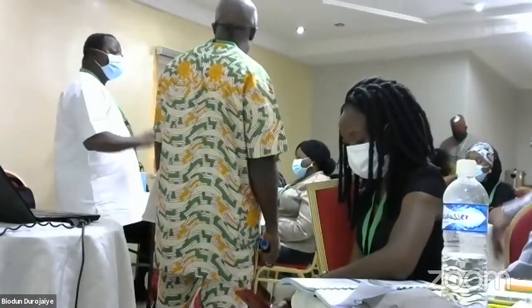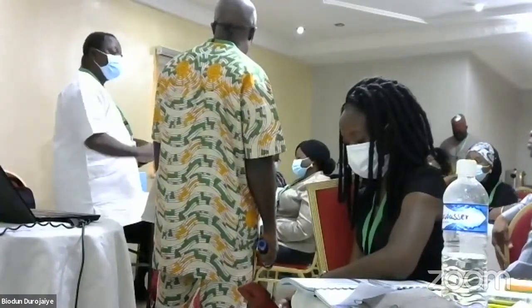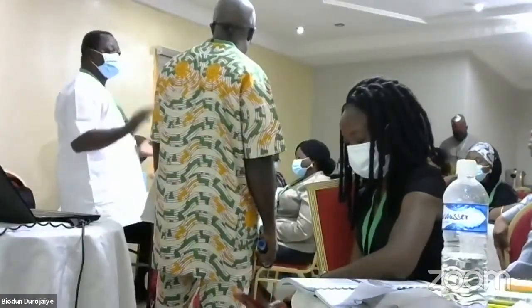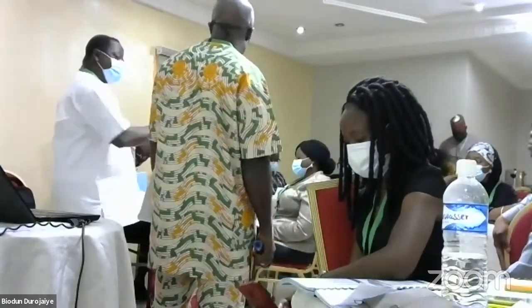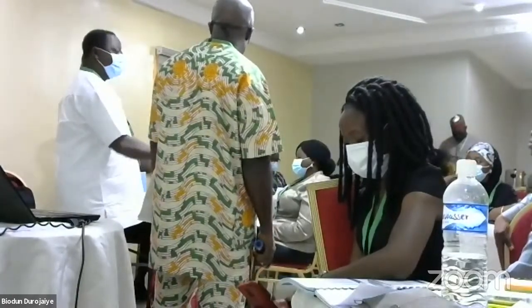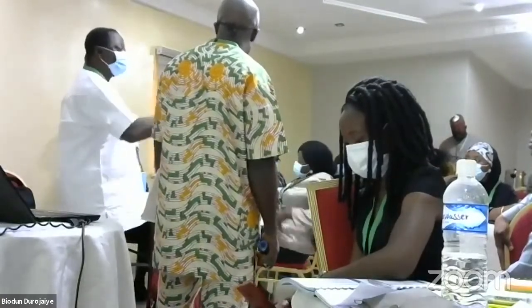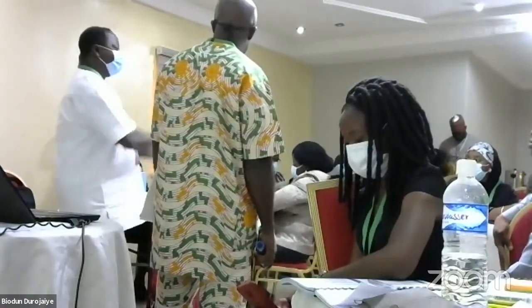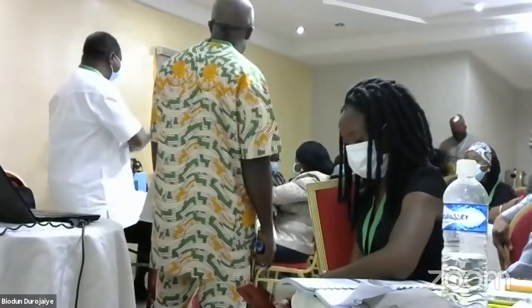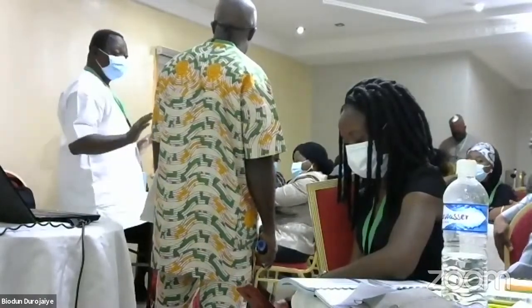But when you have a particular purpose in research, you might not have to follow the two processes. In which case, the SOP does describe that you dip in stain for 10 minutes. It doesn't matter whether it has overstained or understained. In that case, that is no longer a routine practice.